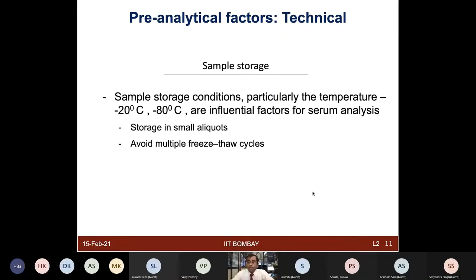And please take it seriously that there's a lot of investment you are going to put in, a lot of time investment for analyzing the data and trying to make sense of the data, but that will not make any sense if these parts are not done carefully. The first part: what is your biological question to be addressed, which technique you are going to take, which platform you are going to use, what will be the strategies in that platform. Second is your input sample type, how well it has been collected and how well you have removed the variability.